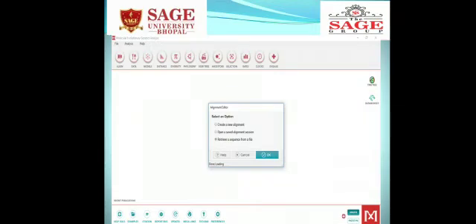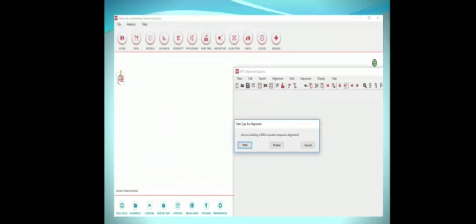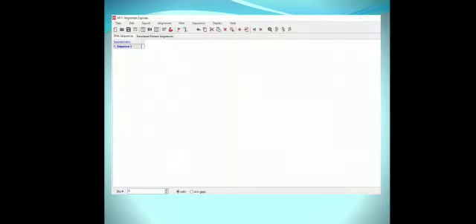It will ask you for one option, whether you are going to use a saved alignment, retrieve a sequence from a file, or create one. So here we are going to create a new alignment. We will select the Create New Alignment tab and click on the OK button. After that we will select the type of sequence which we are using. So in this study we are using DNA sequences. You can also use a protein sequence. In that case you have to select the protein option, but here we are using a DNA sequence, so we will move ahead with the DNA option.